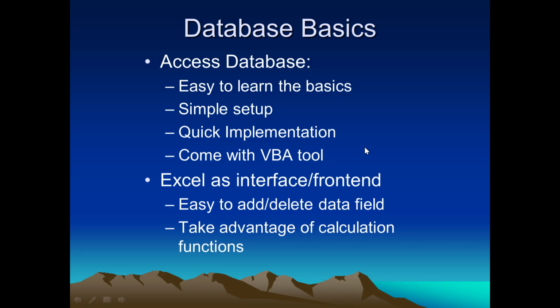So we set up this database. You may ask, Access has all the functions to build forms, so why use Excel here? Access is a very simple, easy-to-learn database, and it can make your design work very quickly. I use Excel as the front-end interface.